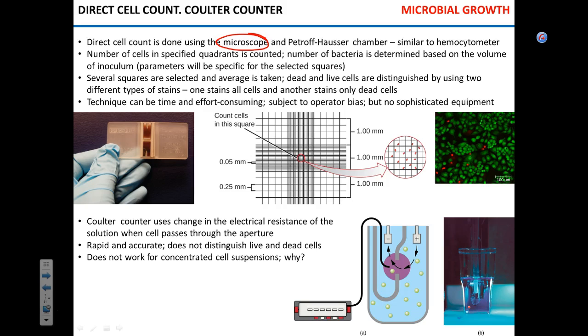directly, okay? And if you remember the samples that you've taken, the wet mounts and the fixed specimens, there were a lot of cells there. And when you look in the microscope, there's a certain field of view, and you don't really know how big that field of view is. So if you counted 5 cells in what? In 1 microliter, in 2 microliters, in 50 microliters.